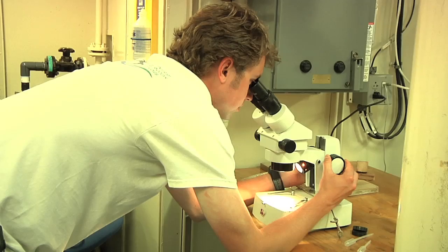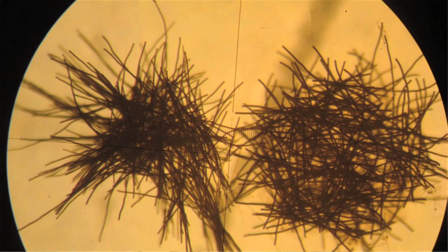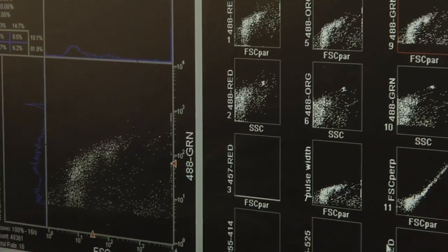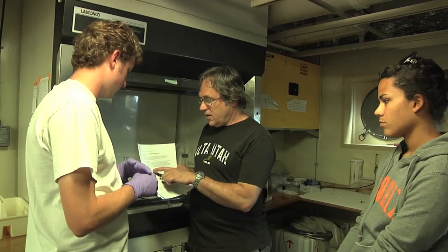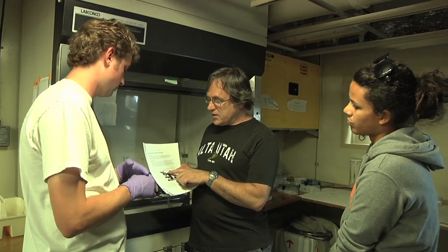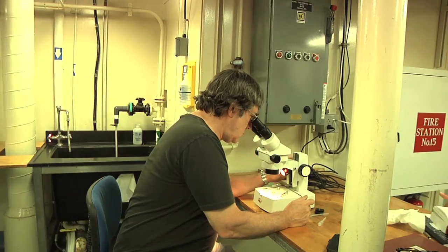They are using microscopic techniques, looking under a microscope to see this material. They're also using a flow cytometer, which allows you to count this stuff. We are very fortunate to have Dr. Mike Siraki from the Bigelow Laboratory for Ocean Science on the cruise with us, leading the microscopy lab.